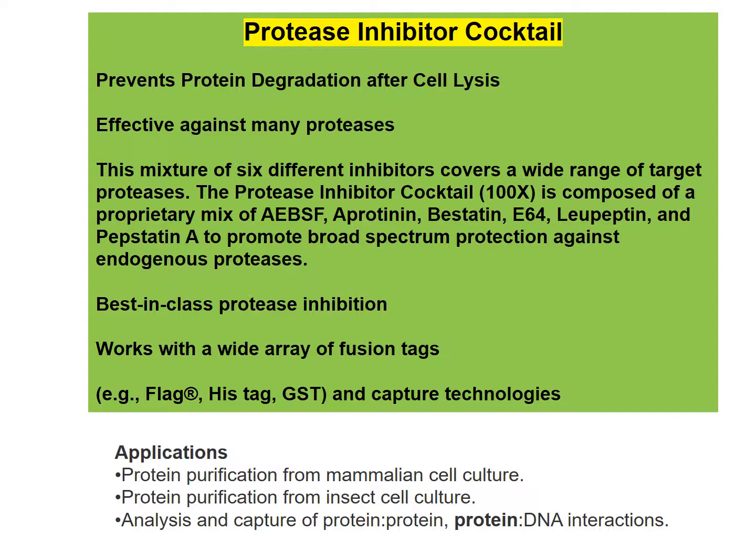So this is my cartoon or my list, protease inhibitor. They call it a cocktail, and you can actually buy it from the various biotech companies, Promega, some of the other companies, Sigma Chemical. They're on the internet. If you have some spare time and really want to nerd out, just go look at the catalogs, and you'll find some of the information about common methods and chemicals used.